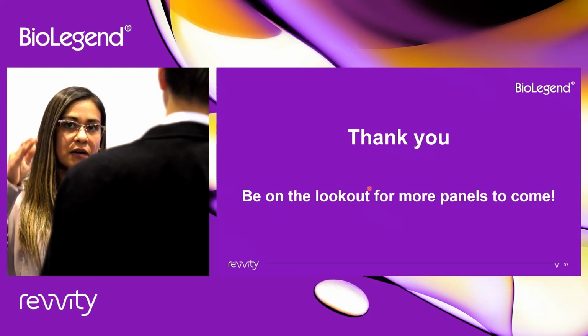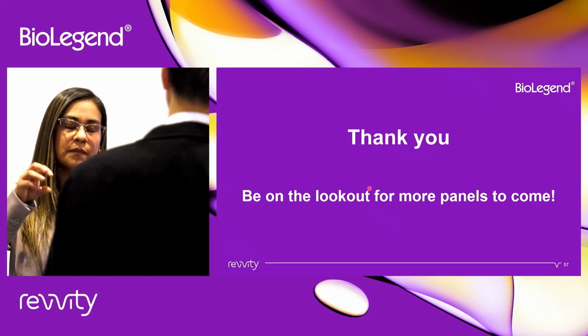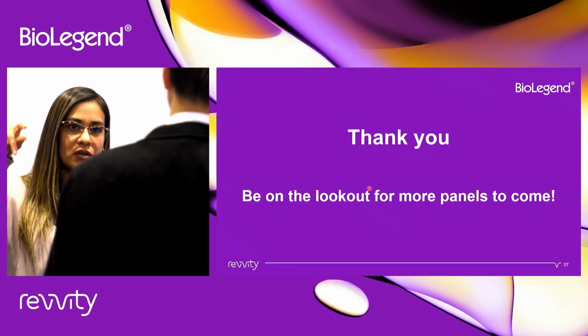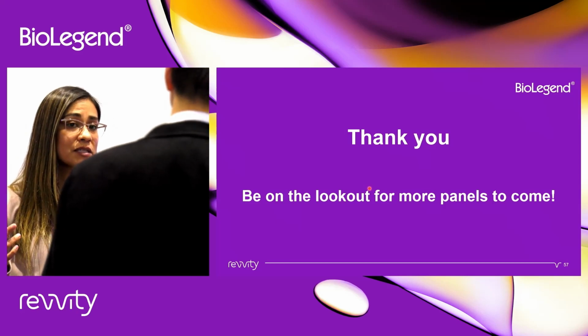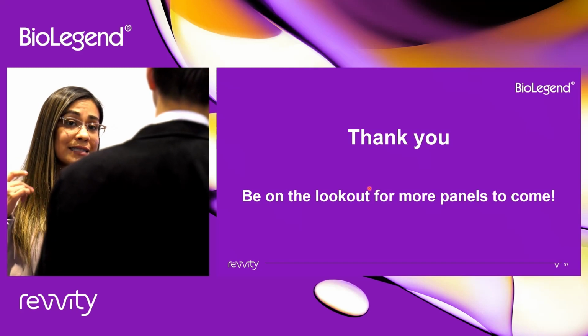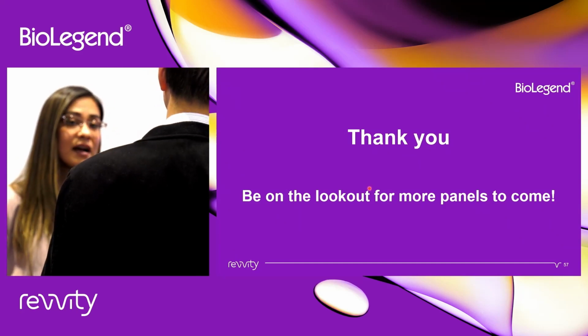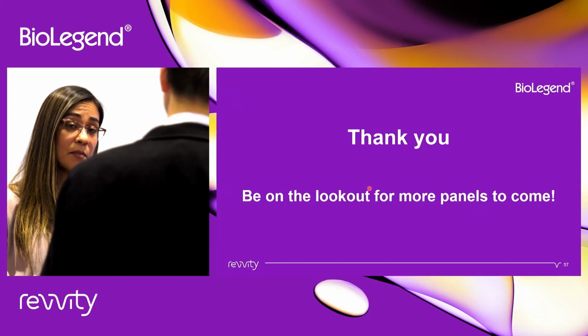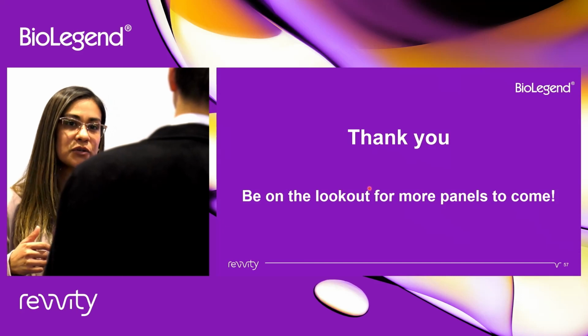So you are going to observe that spreading error in the negative, but the positive populations are well distinguished. Again, sometimes it's going to depend on the cell type or the sample that you are analyzing, how abundant those molecules are in your sample. But at least for the human general phenotyping panel, they have a good resolution.